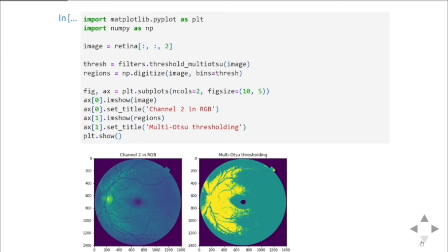If we apply the same kind of filtering on the other 2 channels, R and G, I'll let you try it at home. You'll see that we don't pick the other structure of interest, the light one.